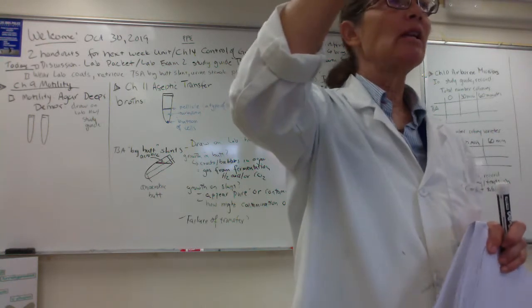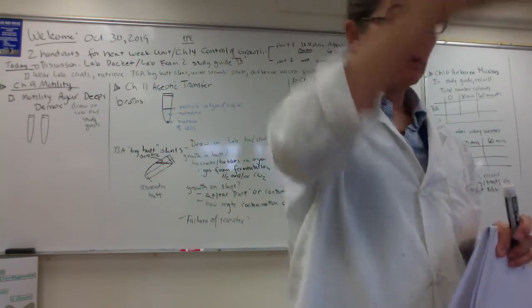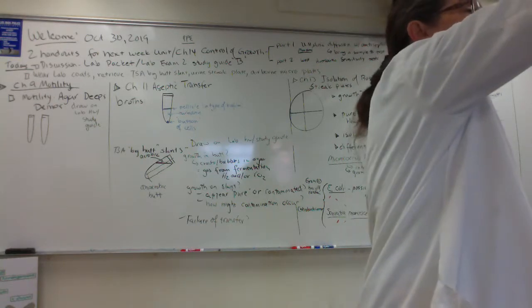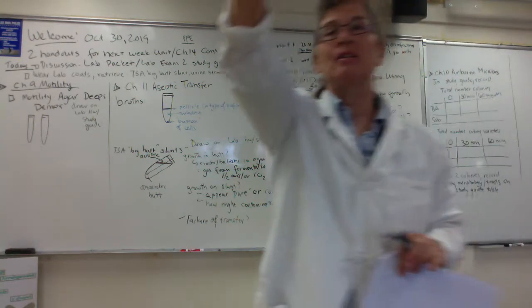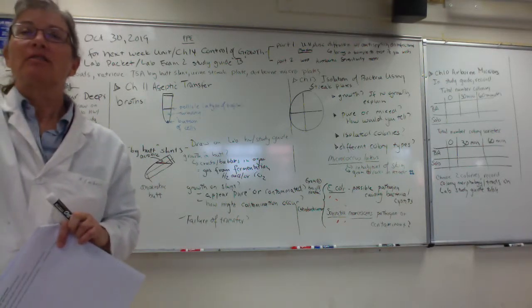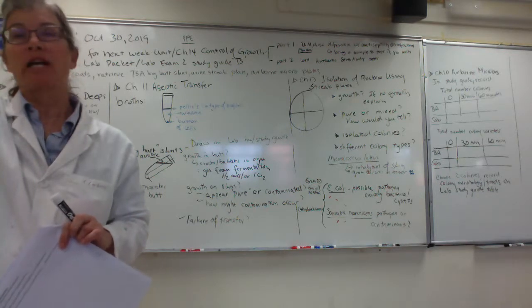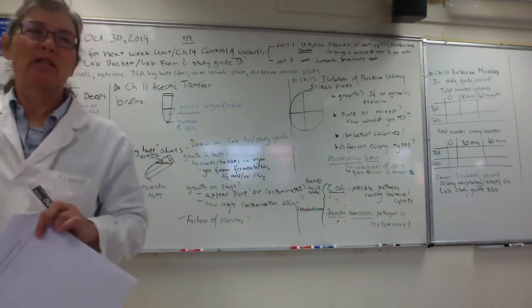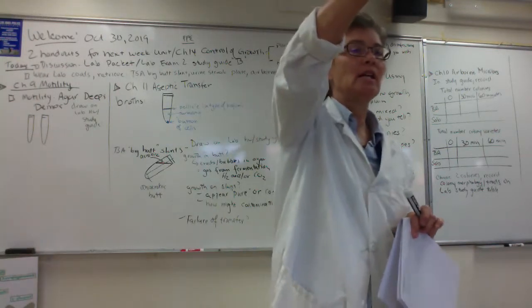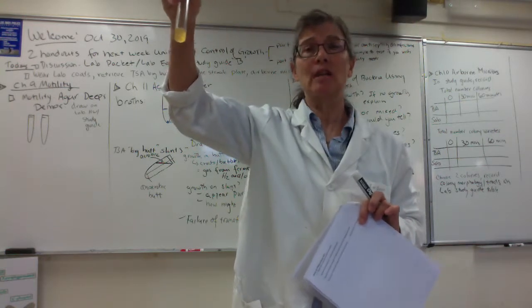But there's 3 indicators of growth in broth and liquid medium, folks. First of all, it appeared that this broth has microbes in it. And how can you tell? It's turbid, it's cloudy, right? So we know cells are present. Do we know they're alive or dead? We don't really know. And very importantly, guys, can you tell just looking at this with your naked eye if it's pure or mixed? Can't, right? That's a big disadvantage of broth cultures.